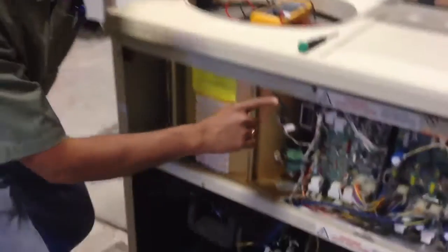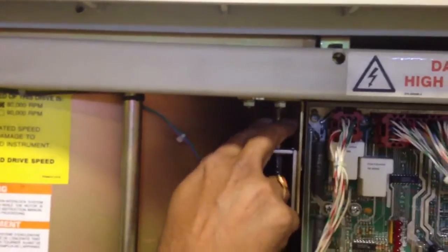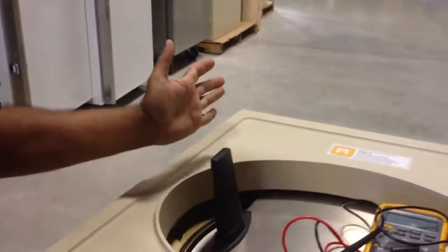You see this solenoid here — this is how it comes down. I am using my fingers to pull it down. Keep holding it down and then open it.